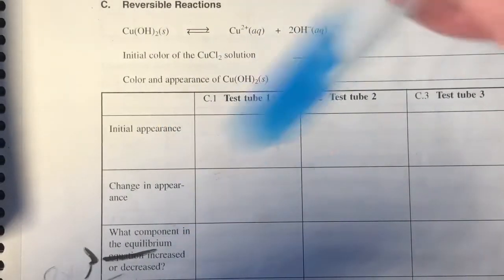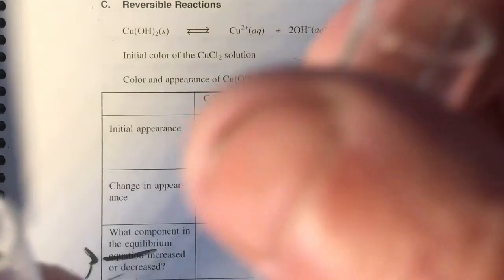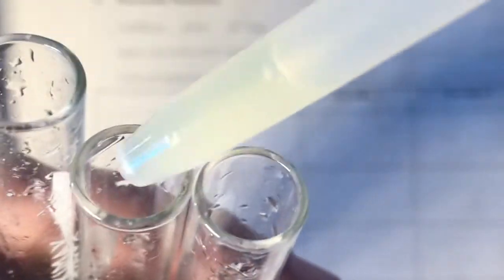And we should see more formation of the solid. We'll add ammonia to the second one. Come back to that, and we'll add hydrochloric acid to the third one.